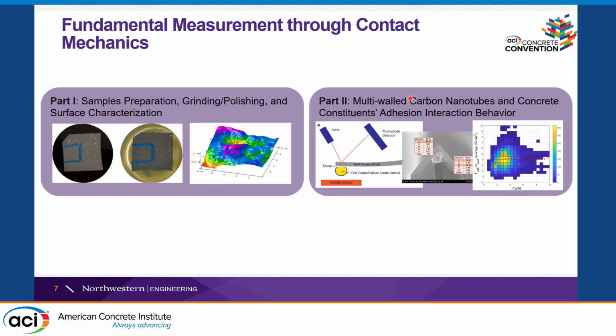So I did fundamental contact mechanics measurements. This is one part of my thesis, so the first two parts. First is doing a grinding and polishing procedure for contact mechanics to have a very low roughness surface. And then I developed a CNT-coated AFM tip that I can use to measure the adhesion strength between the surface of the sample and the CNT on the tip.